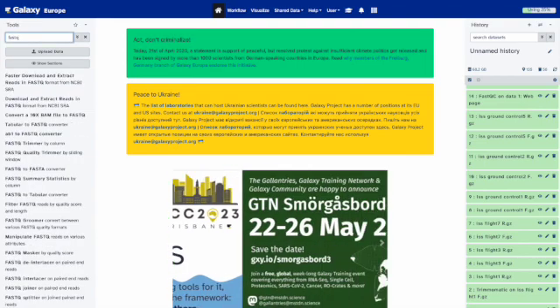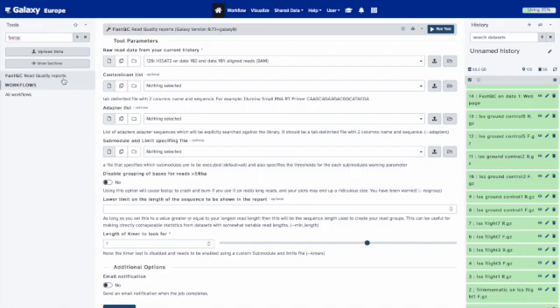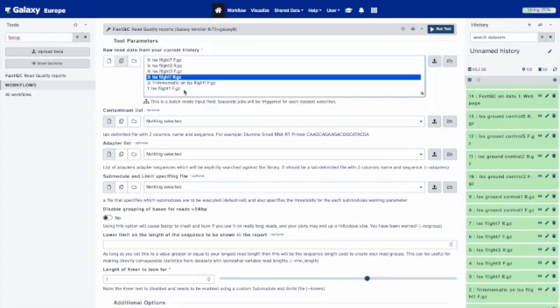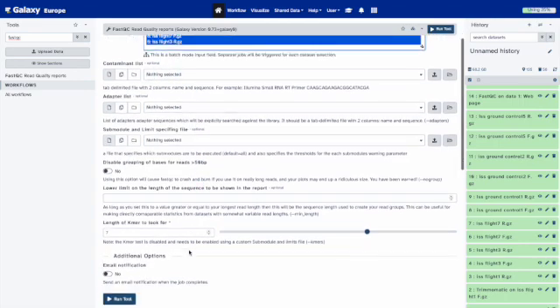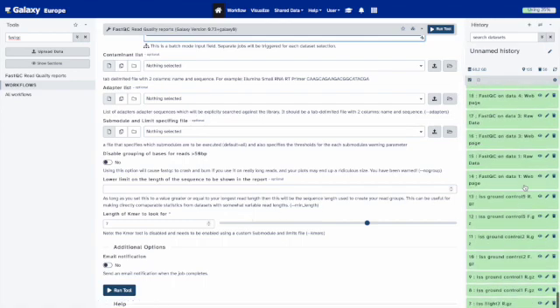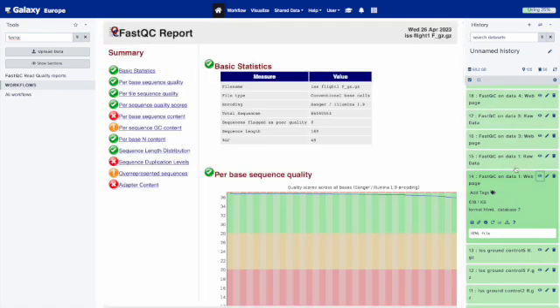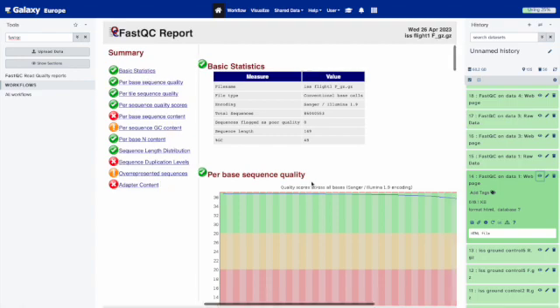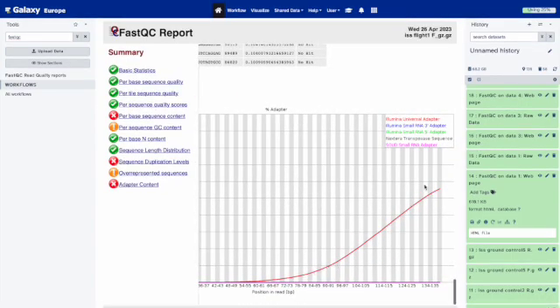The first thing we want to look at is the quality of our reads. You can look at this after trimming as well. Go into FastQC — Fast Quality Reports — and select all of your reads of interest. You can do multiple selections, don't touch anything else, and press Run Tool. When done, the results come up on the side. You can see quality throughout the read and sequence length. Notice we have adapters that need to be removed, so we'll do that after trimming.